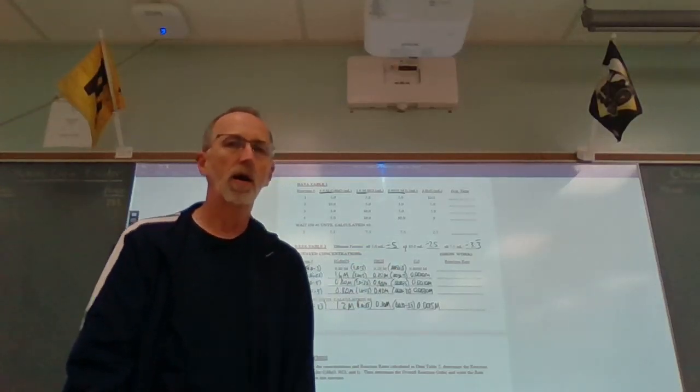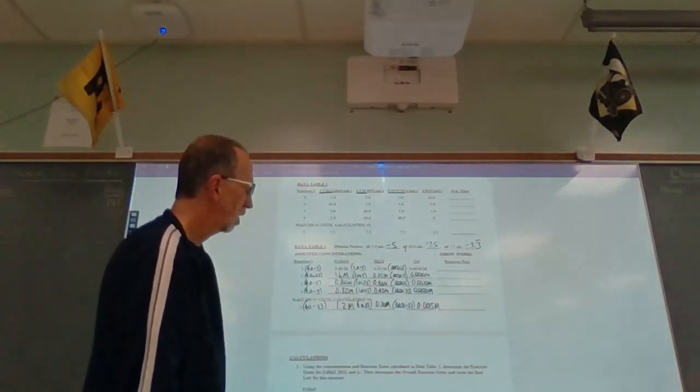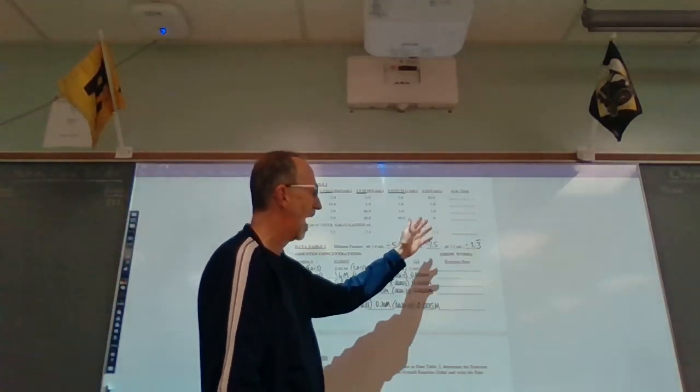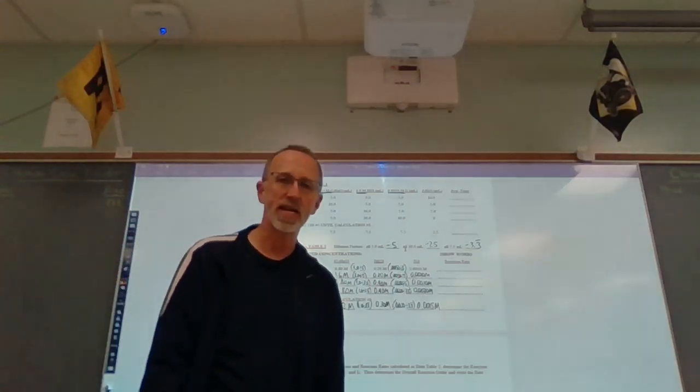Okay? All right, so this takes care of this portion. We're going to go back here in a second and talk about the procedure itself, and then we will come back and fill in the rest and then take a look at the calculations.